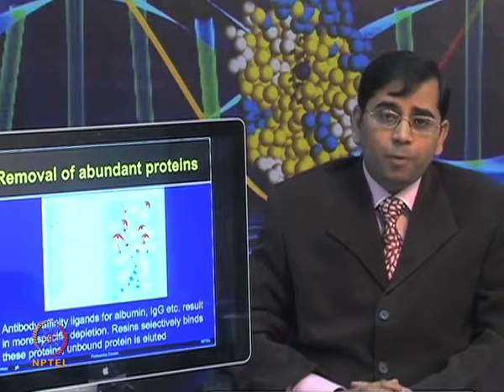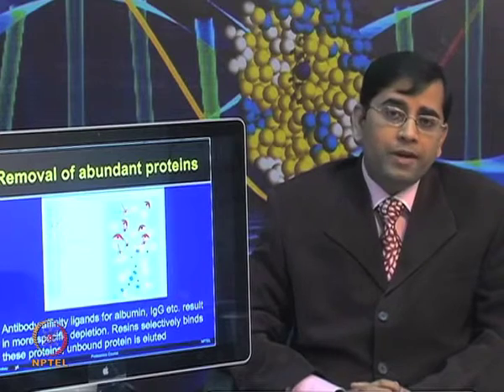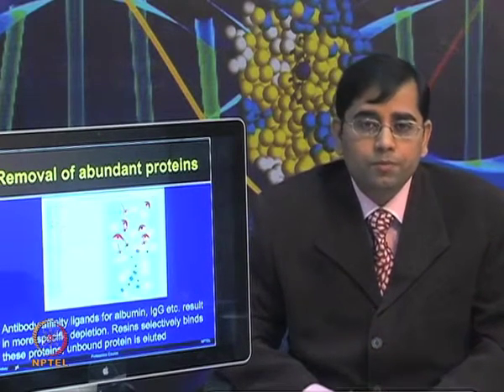There are different ways people have tried to remove these abundant proteins. Molecular weight cutoff and different types of chromatography methods have been used.